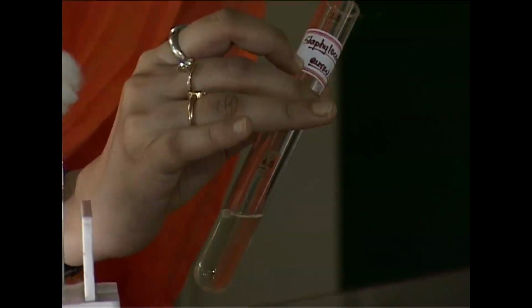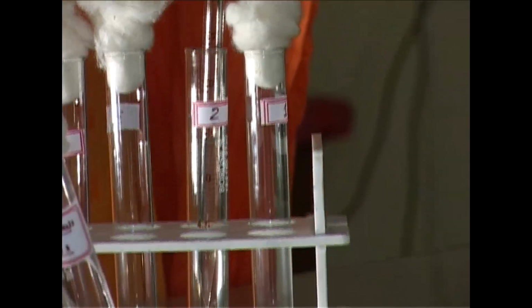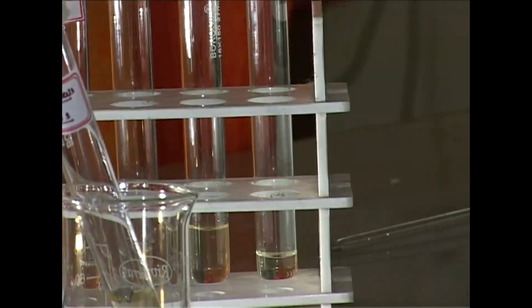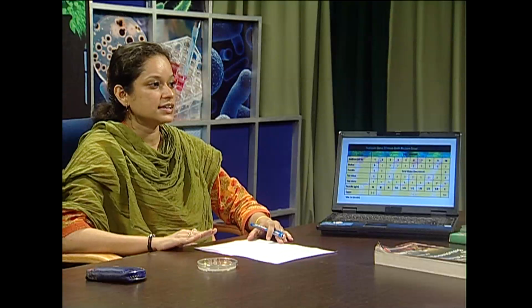Now, you add a test culture, that is a 1:1000 dilution of Staphylococcus aureus, to each of the tubes. That is, to each of the tubes you are adding 2 ml, so the total volume becomes 4 ml. This is your antibiotic stock. So you know the concentration of antibiotics since you are using a pure antibiotic solution. Now when you are diluting it, the concentration of antibiotic is reduced. So that's why you can find out at which concentration the growth of bacteria is completely inhibited. That is why it is known as MIC, minimum inhibitory concentration.